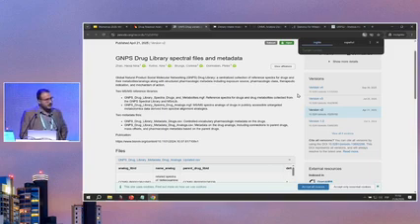It's related to version 4. And then you see that you have the two MS reference libraries: the first one is the drug library, with spectra of drugs and metabolites, and the second one is only for the drug analogs.